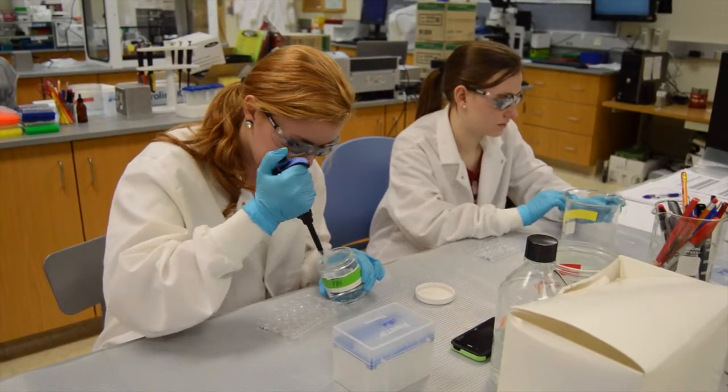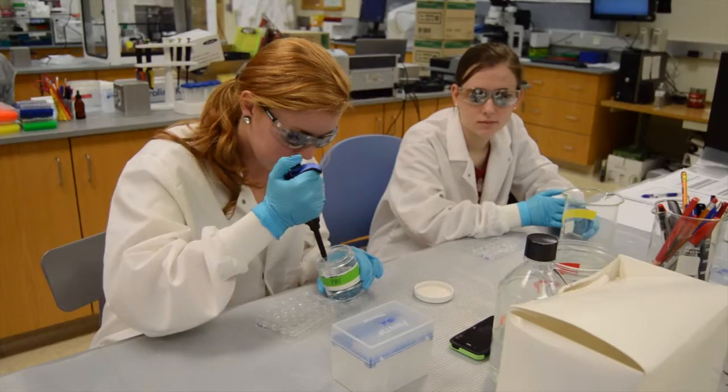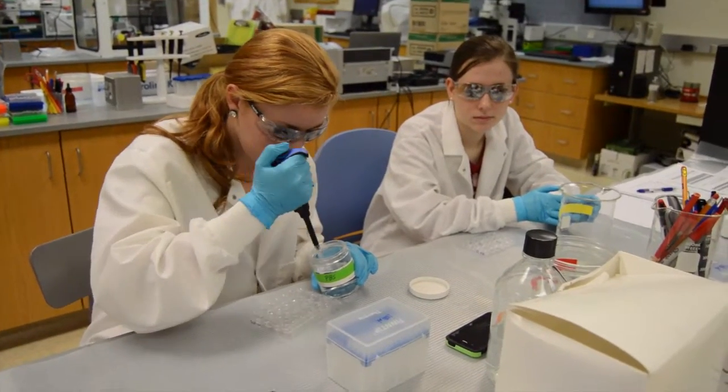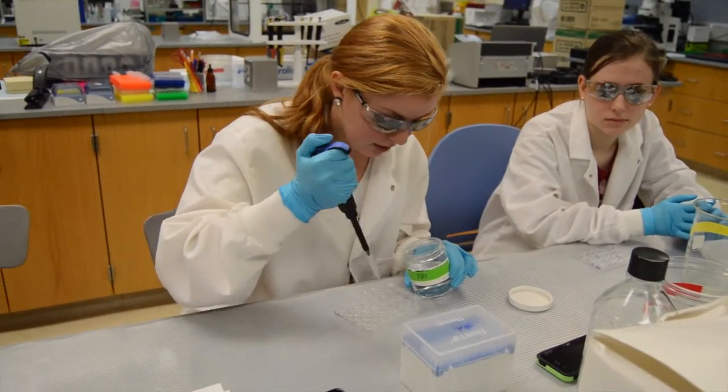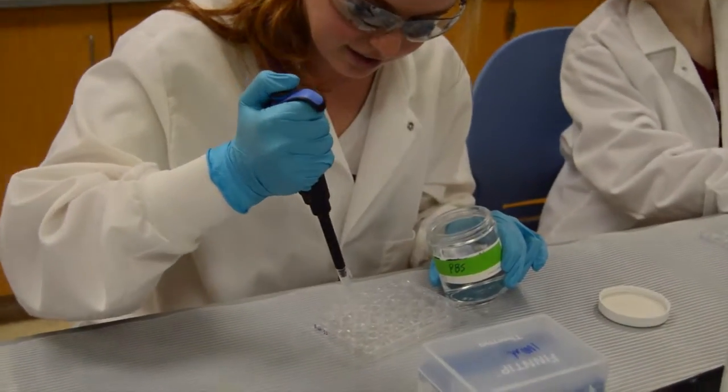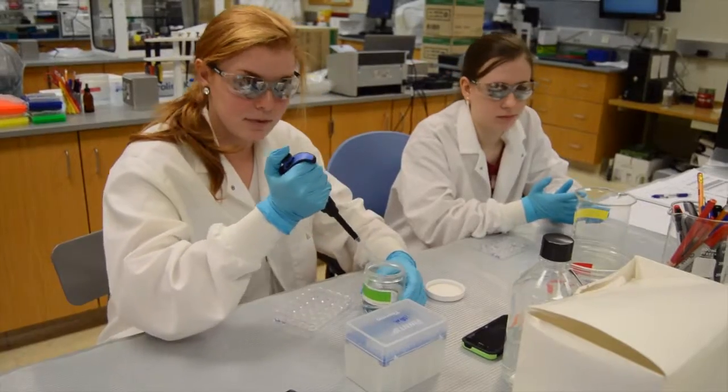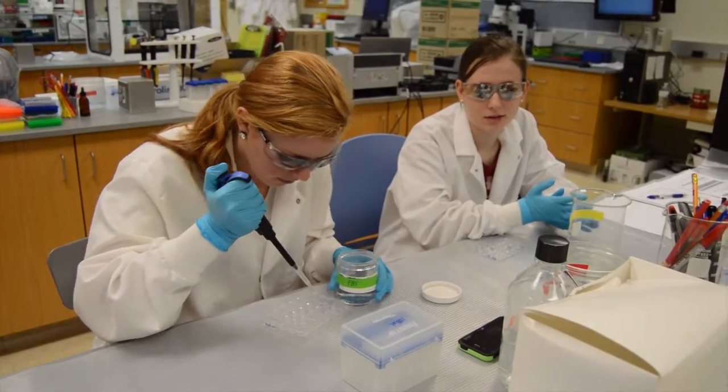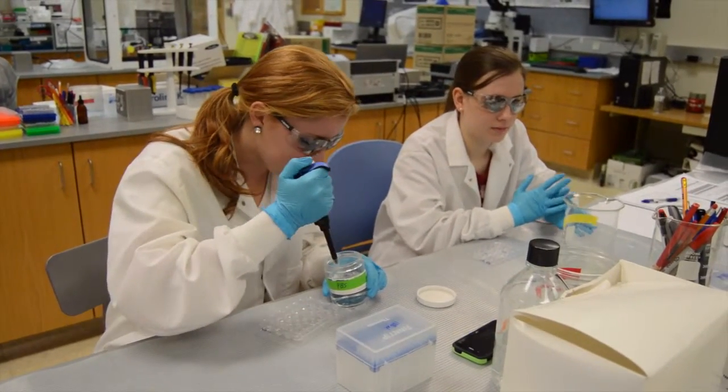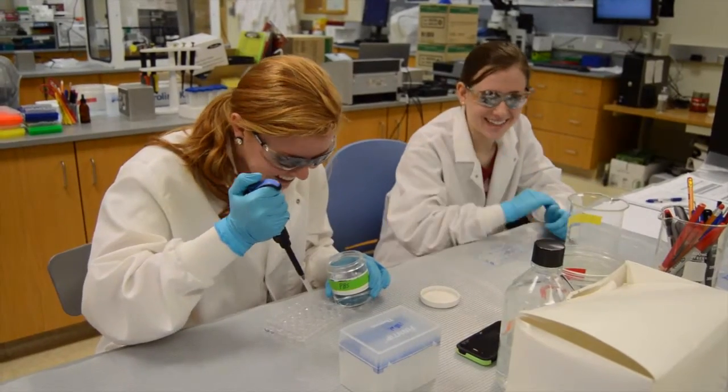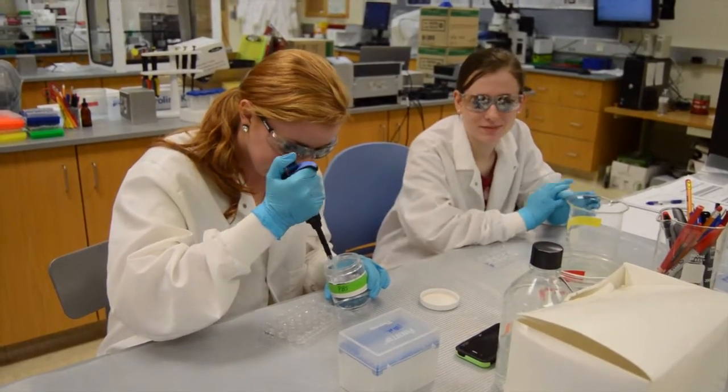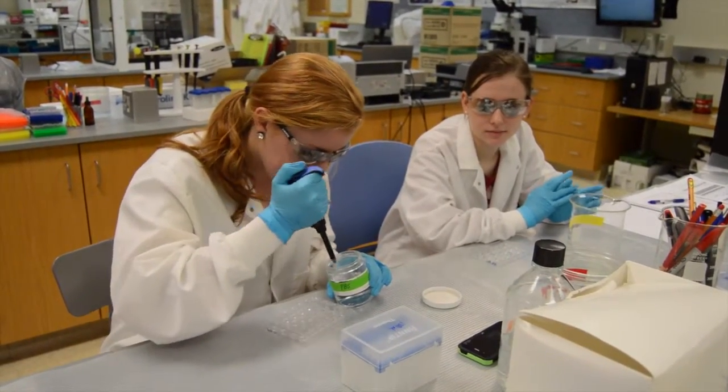Next, add the primary antibody to each well and store in the fridge overnight. On day two, wash the sections again with PBS to remove unbound primary antibody. After washing, secondary antibody is added for ten minutes. After ten minutes, again wash three times in PBS for five minutes. Then add avidin biotin complex, ABC, to tag the secondary antibody.